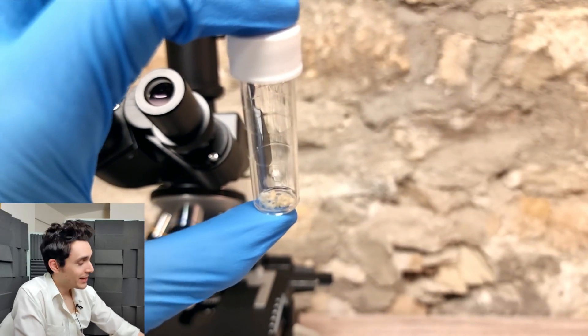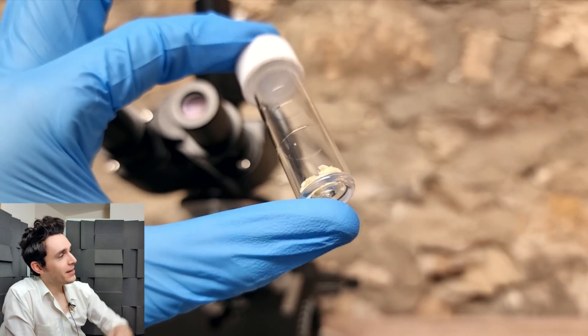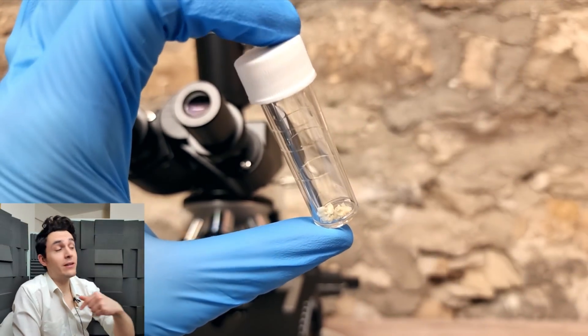Hey everyone, welcome back to this update. What we have here are the samples that I collected from the patients in the previous video.